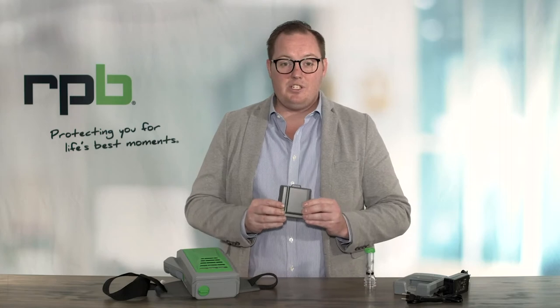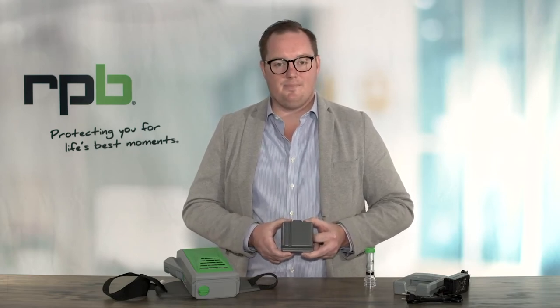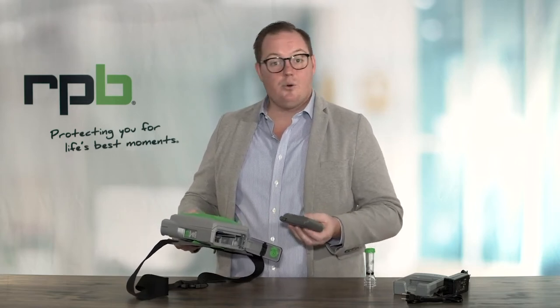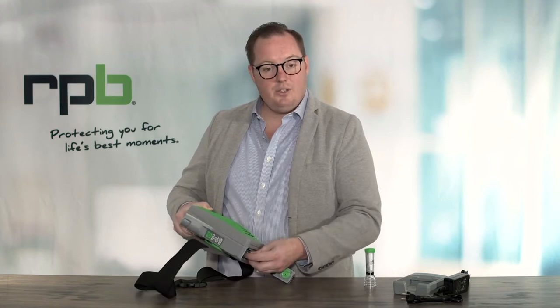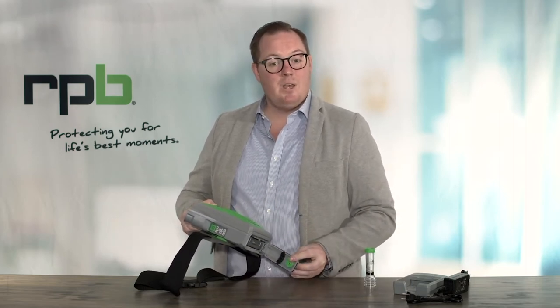Now for the battery. Before you use the PX5, make sure you fully charge that battery for at least three hours — batteries are not shipped fully charged. To insert the battery, unlock the battery door on the bottom of the PX5 and open it. The door is completely sealed, protecting any moisture or contamination from reaching the battery. Insert the battery inside; the LEDs will briefly illuminate to show you the current charge level. Shut that door, twist it locked, and the battery is now secure.